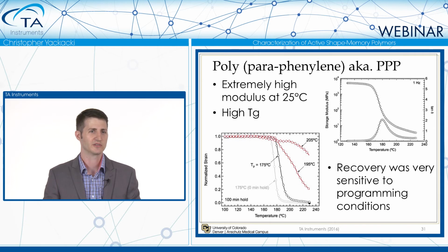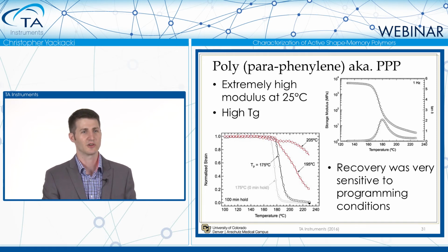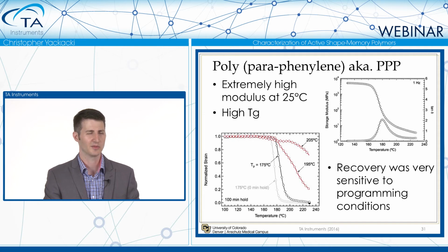We run our glass transition test, and what you'll see looks like a very traditional test. Starts out glassy, becomes rubbery, somewhere around 230 degrees Celsius. That's when the material really started to become a goo, and so the machine would stop, and if it could keep going, the modulus would have just dropped on down. And you can see its glass transition temperature is around 180, 185 degrees Celsius. But extremely high modulus at room temperature. This is probably one of the strongest polymers at room temperature. The modulus comes in at about 5.5 gigapascals, so pretty high modulus and pretty high Tg.